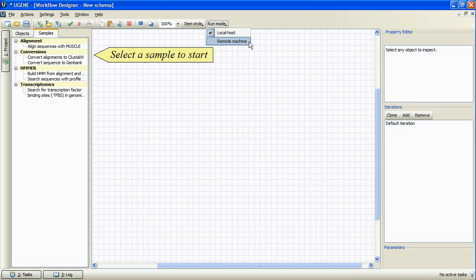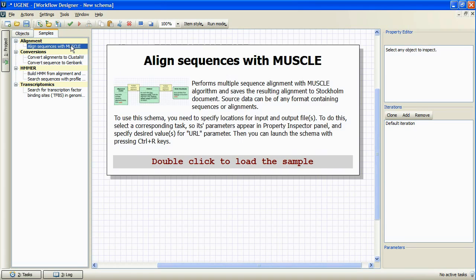Now we will select a sample schema to proceed with, for example, align sequences with muscle.